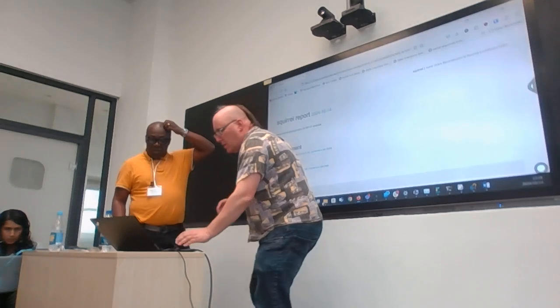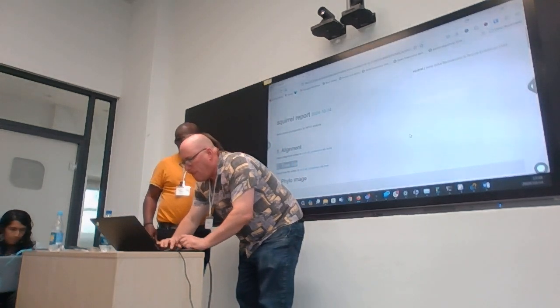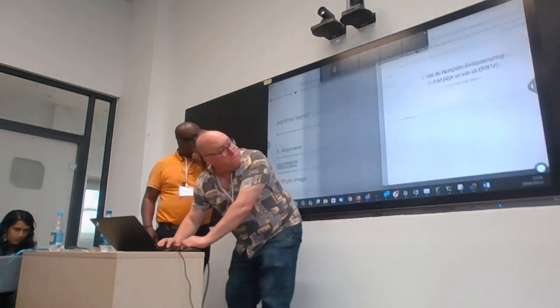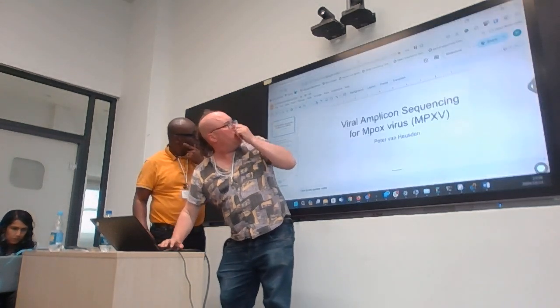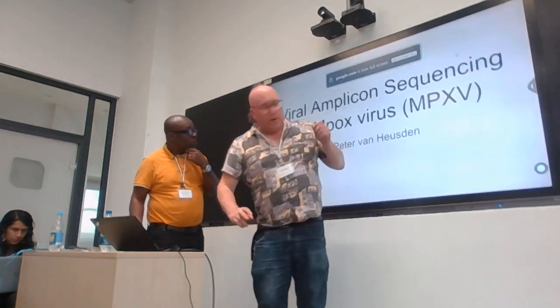Why is it showing him up there? Okay, let's just change where it is. The right place, right? Big. Okay.